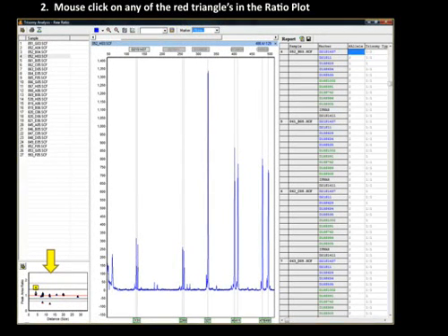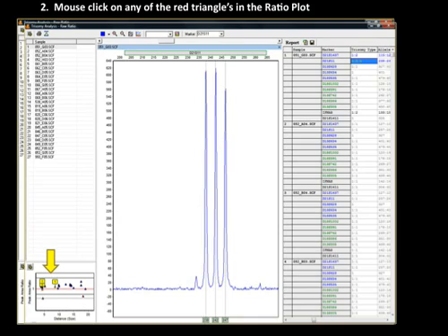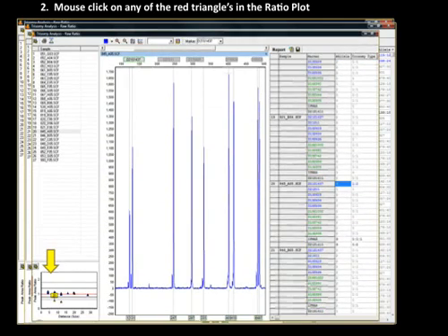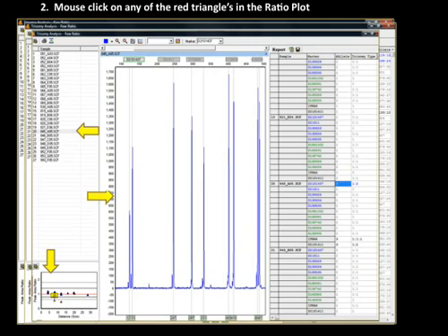Alternatively, we can use the linked peak ratio plots in the lower left to review the results. Blue triangles, as with file 4 in this example, are not in the trisomy range. When we click on a triangle, the selected data point turns yellow. By clicking on one of the red triangles, we see that sample 1 has a 1 to 1 to 1 peak pattern at D21S11. In another example, sample 20 has a 1 to 2 trisomy ratio.